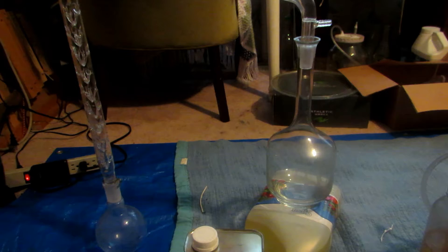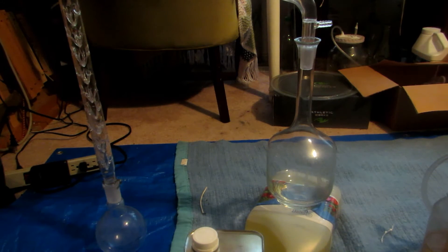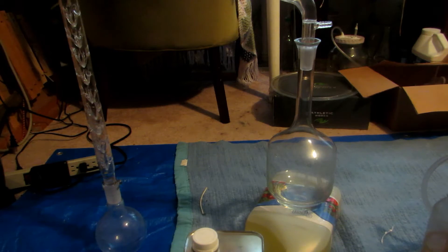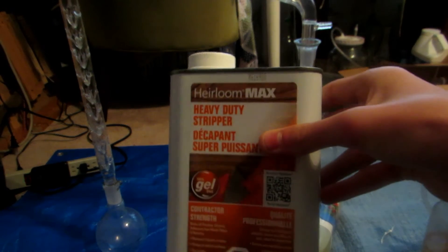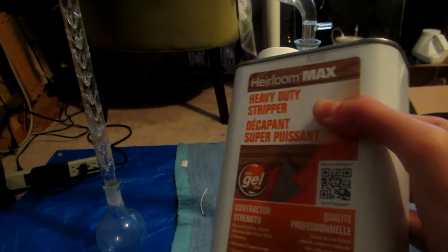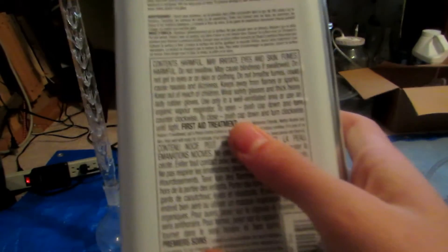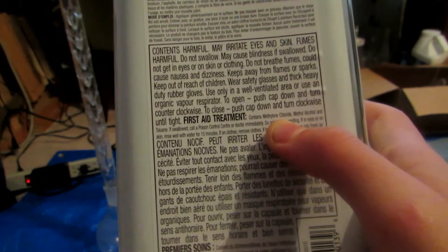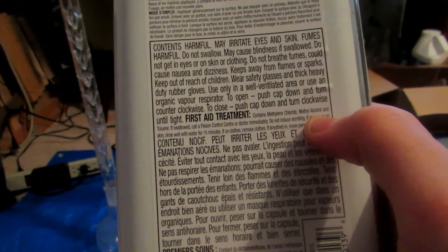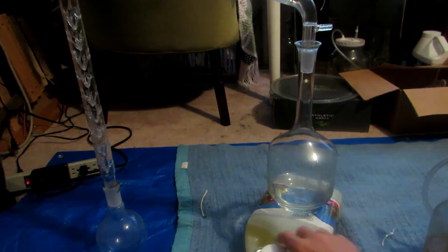Welcome back. Today we will be getting dichloromethane, also known as methylene chloride or simply DCM, from a paint stripper. We went to Canadian Tire and bought this paint stripper — the brand is Heirloom Max Heavy-Duty Paint Stripper — and if you look on the back it says it contains methylene chloride, dichloromethane, methyl alcohol which is methanol, and toluene.